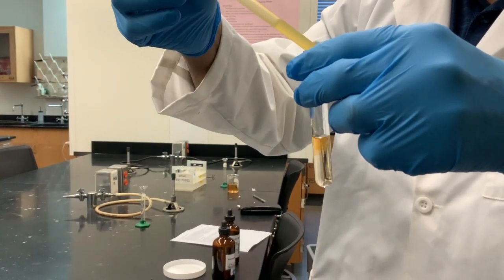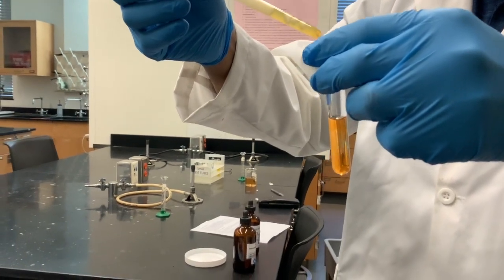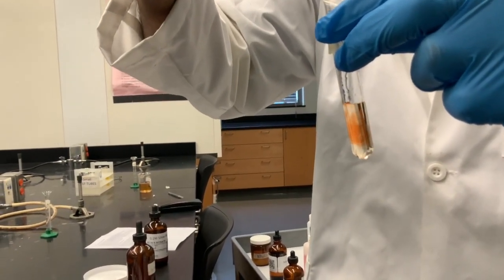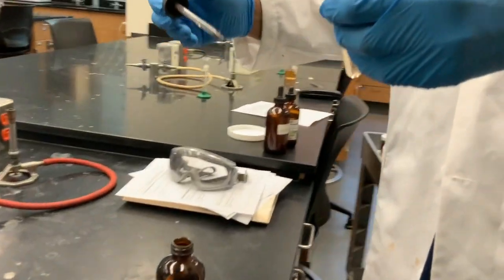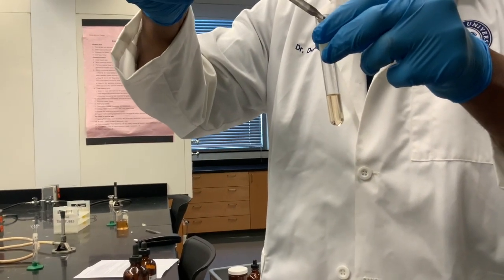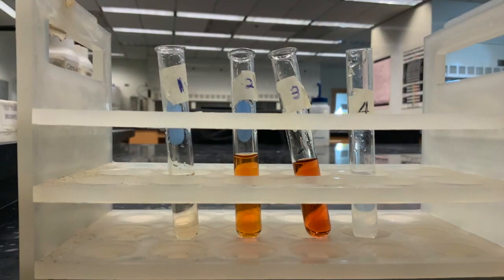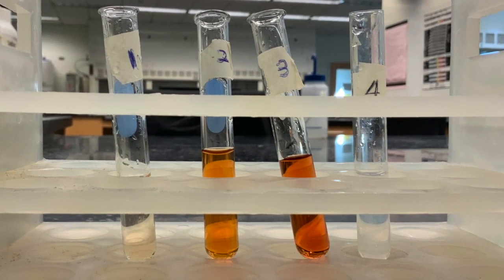To the solution in test tube 2, we add 1 milliliter of 0.1 molar FeCl3. Record what you see in your lab report. To the solution in test tube 3, we add 1 milliliter of 0.1 molar KSCN. Record what you see in your lab report. And to the solution in test tube 4, we add 0.1 molar AgNO3 drop by drop. Record the change you see in the lab report. Lastly, we put all the 4 test tubes next to each other so you can observe the difference.